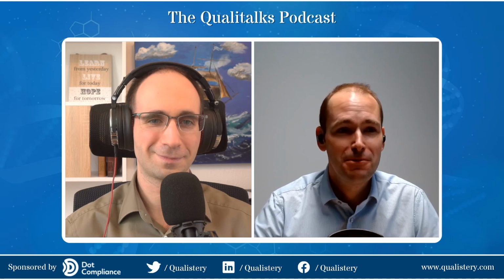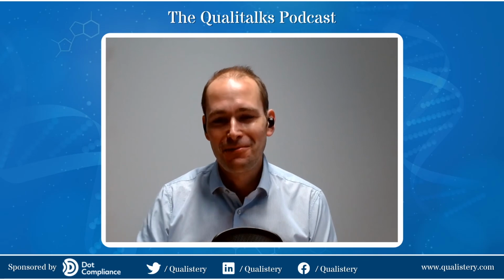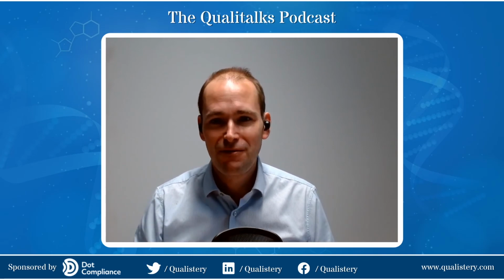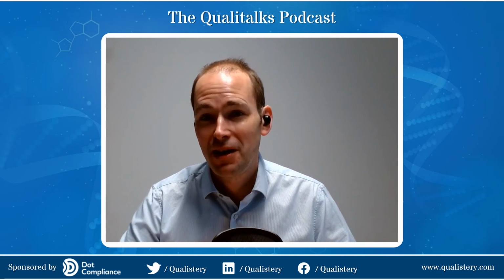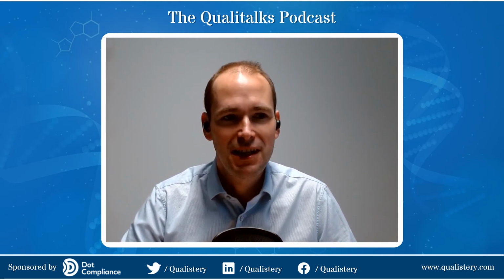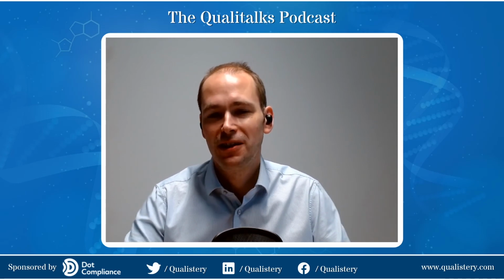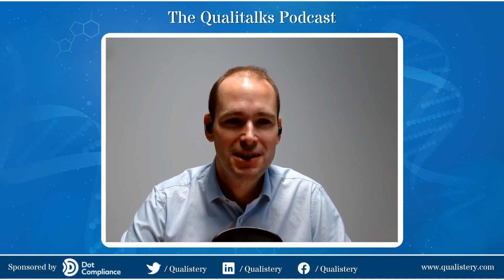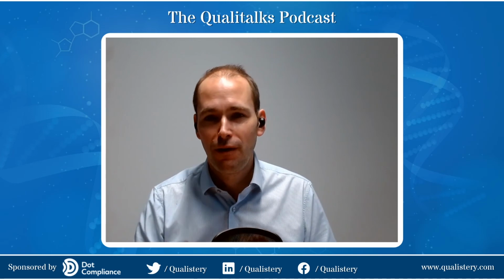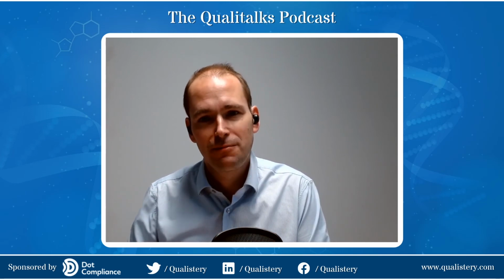You know, that's ultimately, nobody wants any non-sterile units going out of the door. We want to make sure that they're all sterile and we have confidence in it. So we need to make sure that we're detecting any failures as they might arise, and we're preventing any issues that might cause equipment downtime. So we're optimizing the process, really. That's particularly with the URS, I think that's really important, that we optimize that process, get it set up so it can perform and function correctly, as well as possible, as fast as possible, and to the right standards as well. Right.